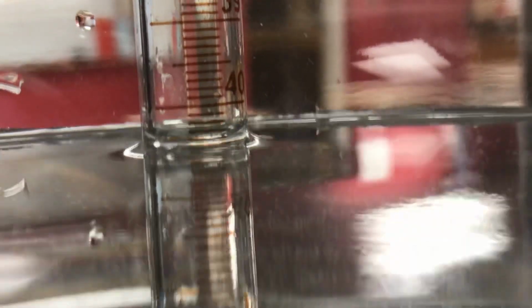All right, gang, what do you think? Should we just go with 40.3, 40.30? Probably pretty good. Yeah, 40.30. Write that down. That's our volume of hydrogen that we've collected, 40.30.